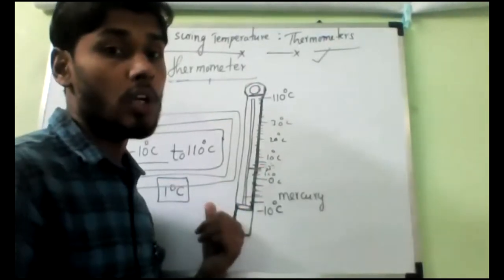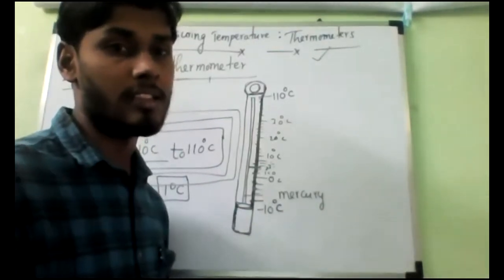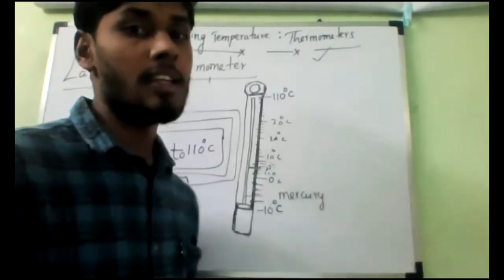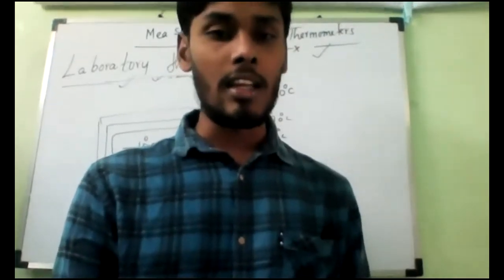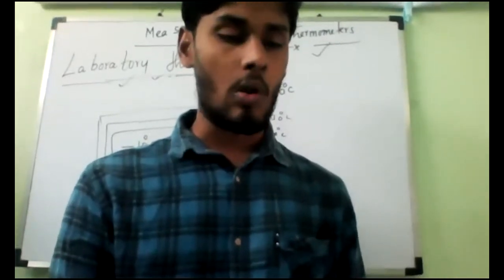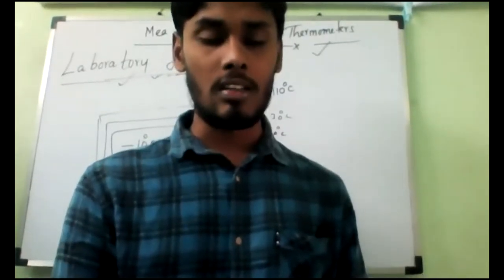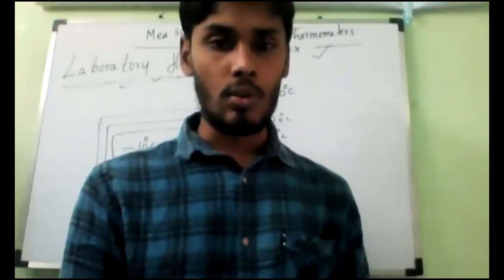So if you look at the temperature marking of, let us say, 0 degrees Celsius and 10 degrees Celsius on the thermometer tube, we will find there are 10 small divisions. To better understand, I will show you the original picture now, so you may understand more clearly, because those Google pictures are not clear. So let us discuss now. Some pictures I will show you.